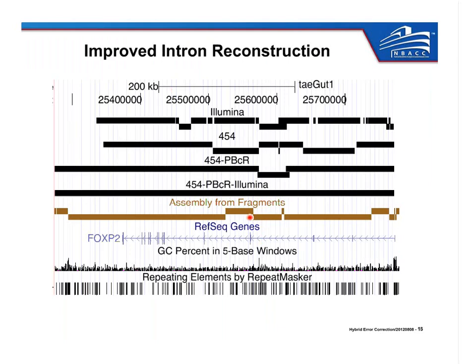If you have 10,000 PacBio reads, how many reads will pass through your error correction algorithm? This is what we've been calling throughput, the number of reads that are successfully corrected by the pipeline, and it entirely depends on the quality of your PacBio run. We've seen throughputs as high as 80 or 90% of the reads being corrected, and as low as 10 to 20%. So it entirely varies based on the quality of the sequencing run.